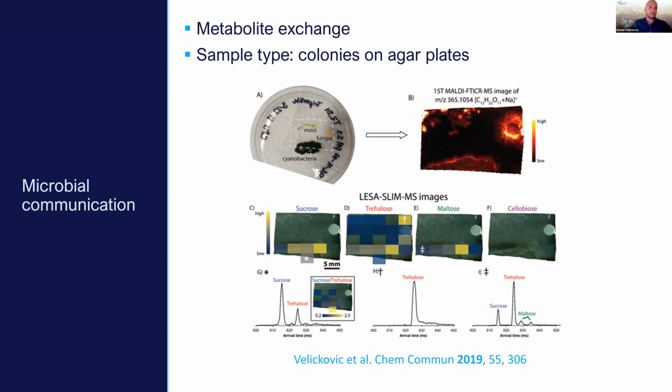For a poplar root cross section, you need approximately 1 hour to analyze it. For this particular one, I'm not completely sure, I think around 5 hours to finish the entire acquisition, but count approximately 1 pixel per second, roughly.